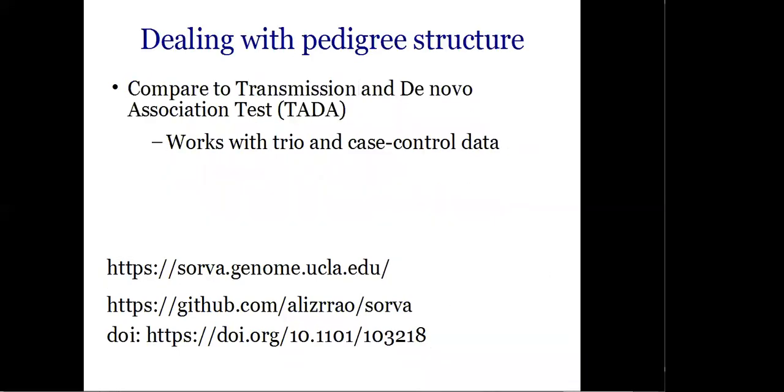So before I get into an example and demo, I also wanted to mention another method that allows you to calculate the p-value for your next-gen sequencing findings.